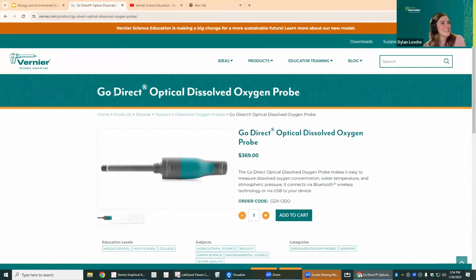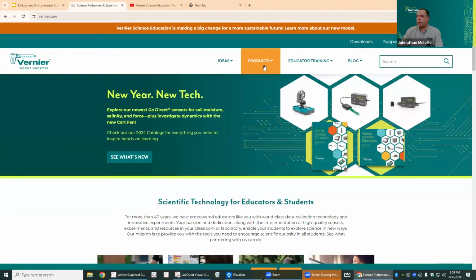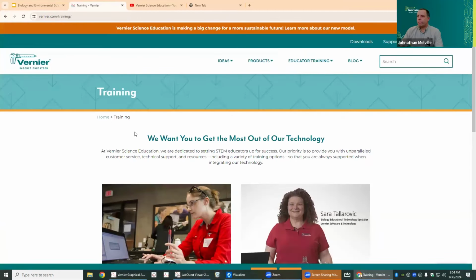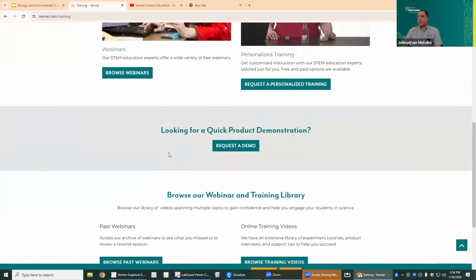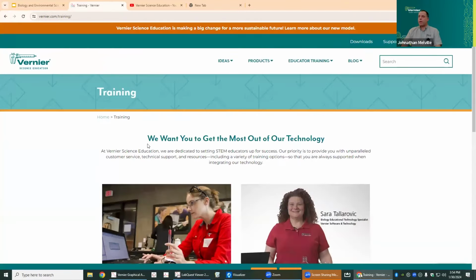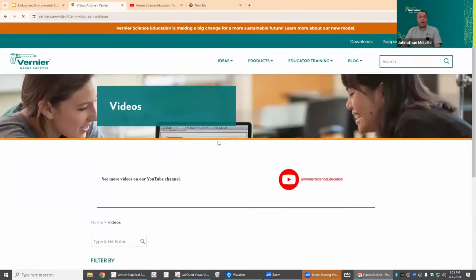And then let me see if I can find it. I think an older webinar even had some stuff on how to actually store your sensors. That was an entire webinar that was done over the summer. Go ahead and look under our webinars or look at the YouTube video and you can find out all about that as well. You can just browse past webinars here, and there's a ton of webinars that you can look up.